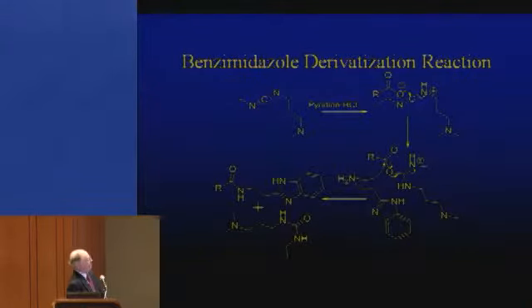You do carbodiimide chemistry. You take a carboxylic acid, at about pH 5, and you protonate one of these nitrogens. That makes the anion come in and attack the carbon. Then after you've formed this structure, you protonate the other nitrogen, and now the amine terminus of this derivative attacks the carbon-oxygen double bond and forms an amide and splits out urea. Now, the urea has got an amine on it, so it gets protonated and flows right through your HPLC column, so you never see that.